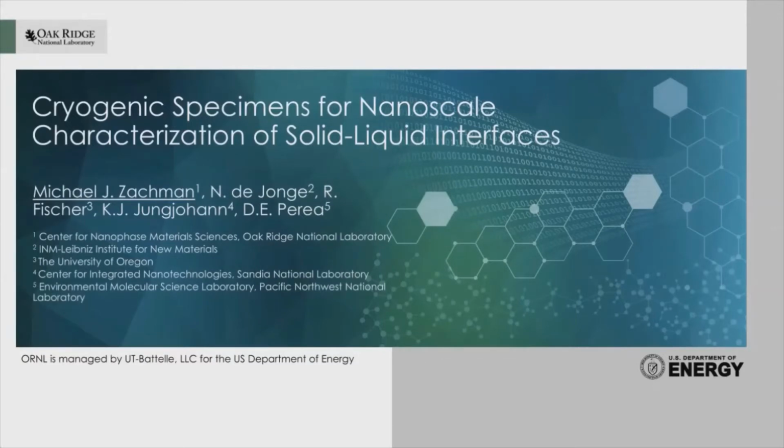I recently wrote an MRS Bulletin article with my other co-authors that you can see listed here. We were discussing how to use cryogenic techniques to access nanoscale structural and chemical information from solid-liquid interfaces, and specifically with the liquids intact. And so in this talk, I'm going to be going over a couple of the examples from our paper.